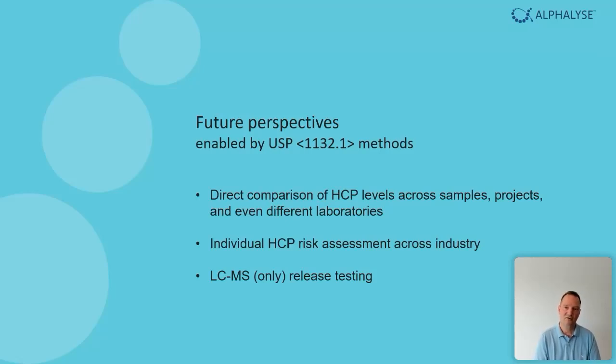If you have a good MS method and you can apply it, there's no need to go and develop a process-specific ELISA. It typically takes 2 years to develop a process-specific ELISA. The mass spec platform is ready to use.